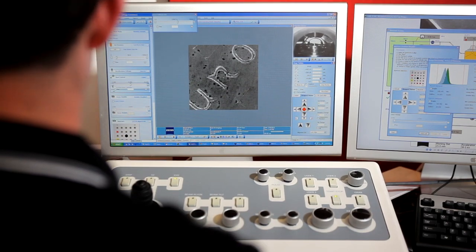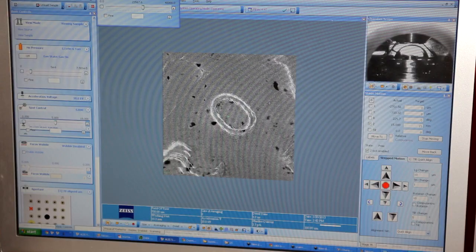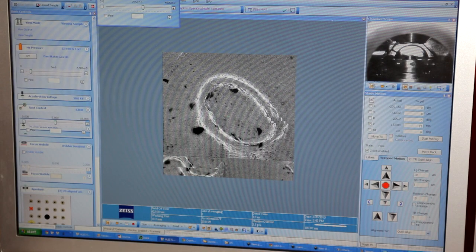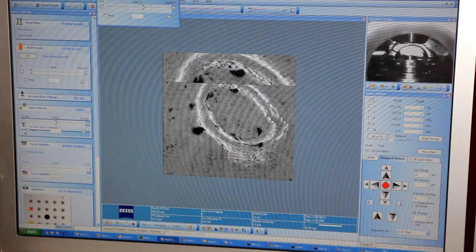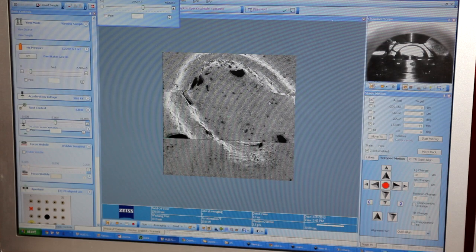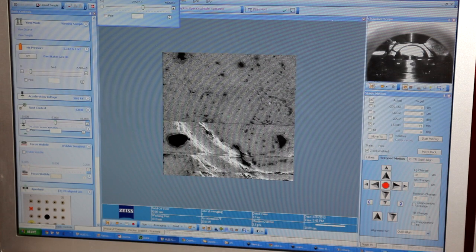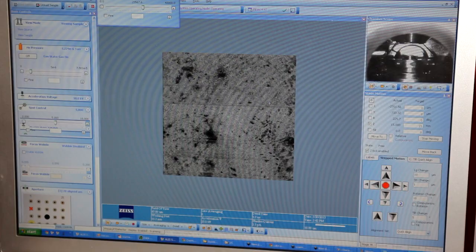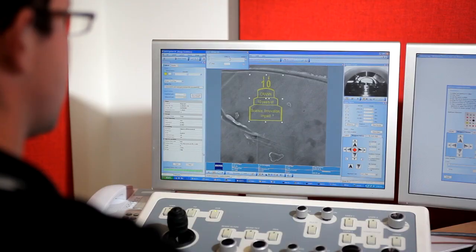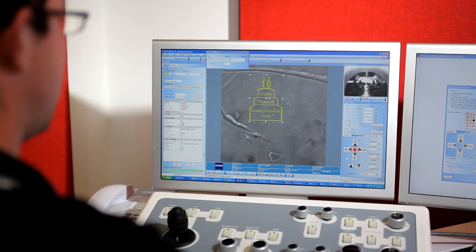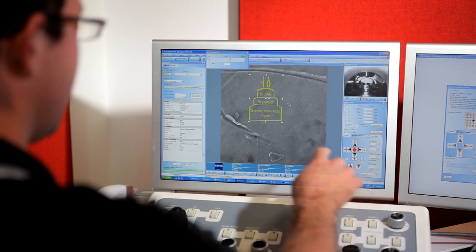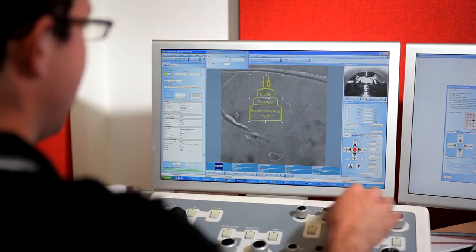What we're going to do is zoom in approximately 40,000 times from here and look at areas on the nanoscale, and we're going to mill in a message using the helium ions. So we're taking an image of the area we're going to mill our pattern into, and we've got the pattern loaded up on screen.